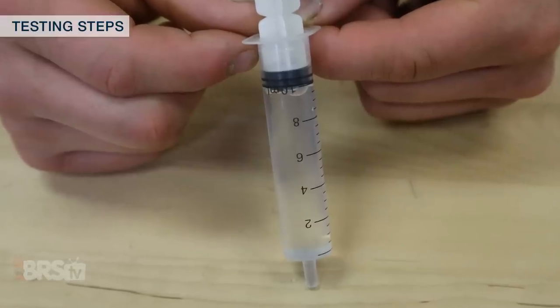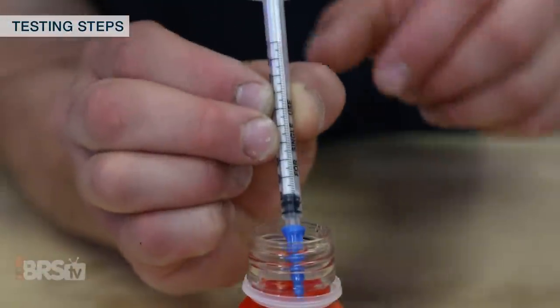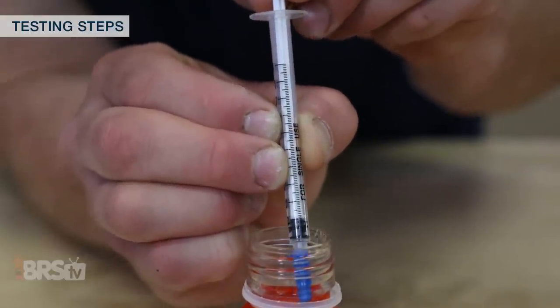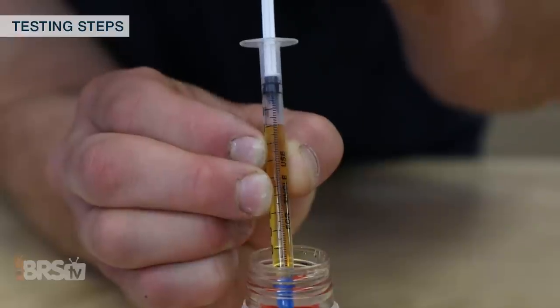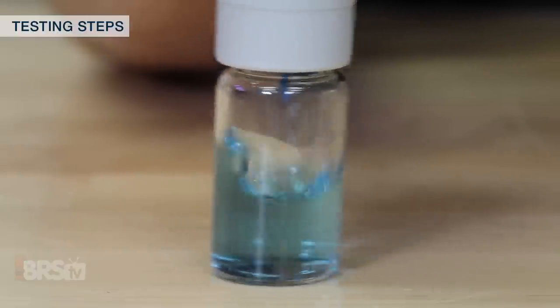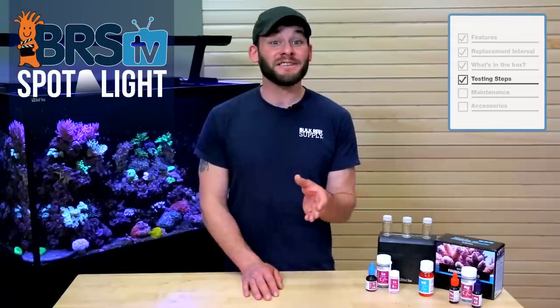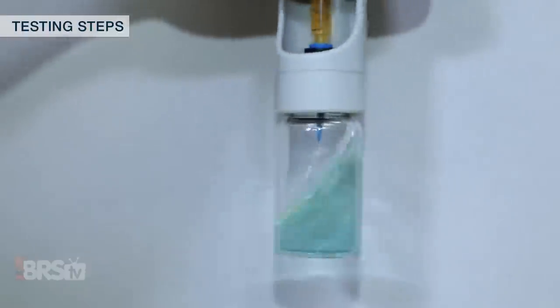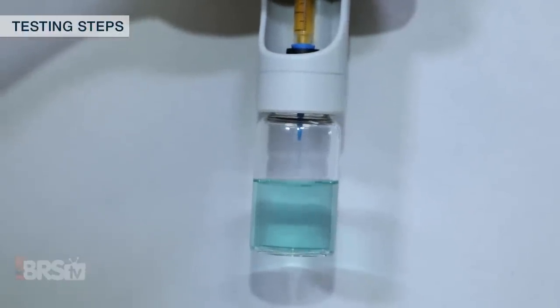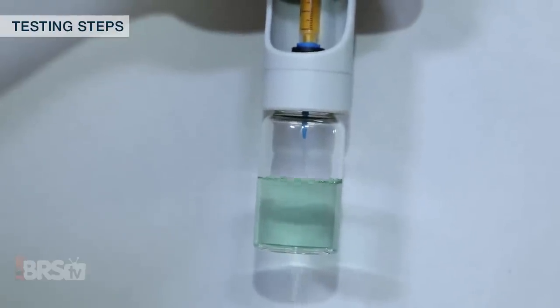Let's first start with the quickest test to complete: the alkalinity portion, where I need to add 10 mils of tank water to my alkalinity testing vial and screw it into place in the titrator. With my blue tip syringe, I slowly draw one mil of alkalinity pro reagent until the bottom of the plunger aligns with the one mil graduation, slip it onto the titrator, and begin to slowly add the solution while shaking at the same time. The sample water turns to a light shade of blue, which is easier to read against a white background, and as I continue to add reagent, the color starts to shift to more of a green. Once the color starts changing, I'll slow down and start adding one drop at a time with a quick swirl after each one, and when the sample is fully green, my test is over.